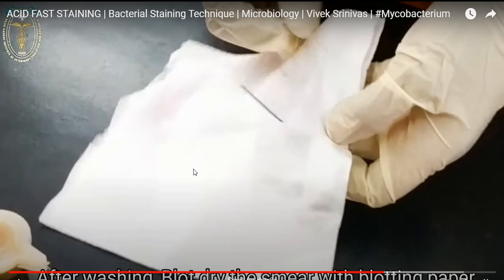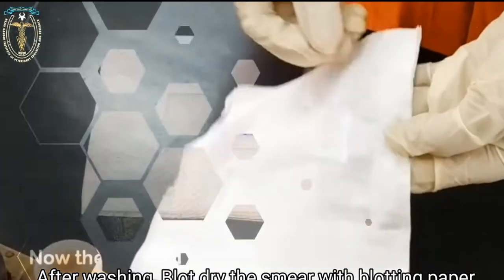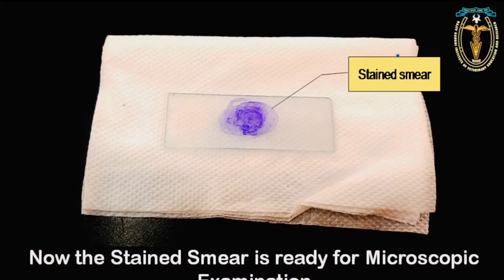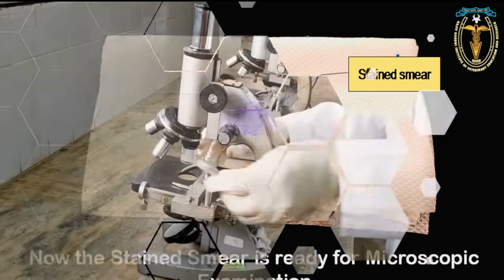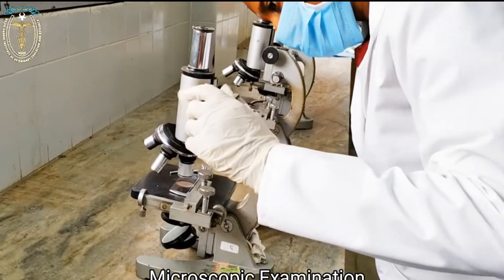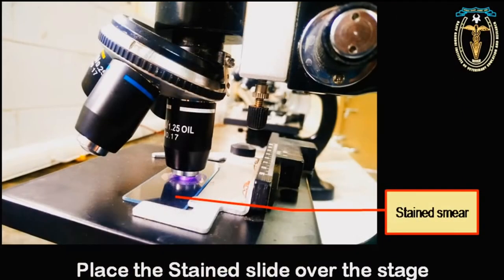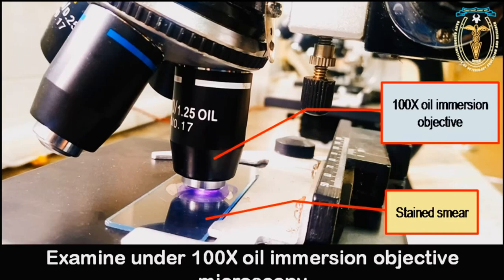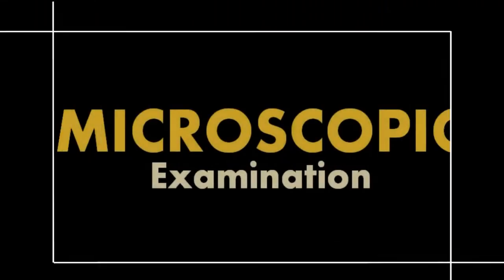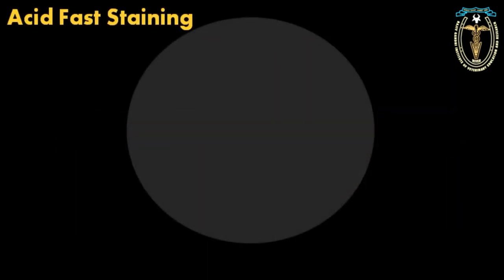Now, coming to the summary of the Acidfast staining technique. First, the preparation of the smear from the sample. After smear preparation, air dry, and heat fix the smear. After fixation, add the strong carbolfuchsin staining solution over the smear. Heat the smear with the staining solution for 8 minutes. After 8 minutes, allow the slide to cool down, and then wash it with the distilled water.